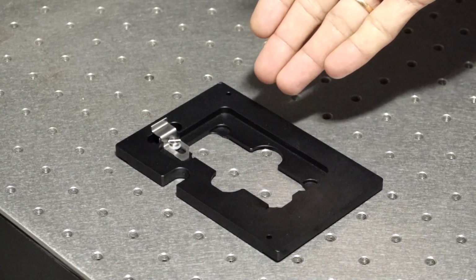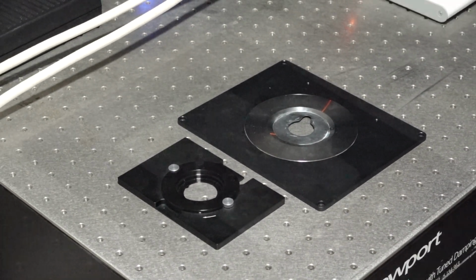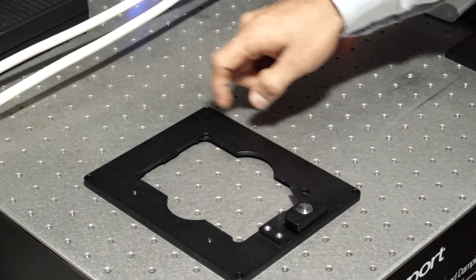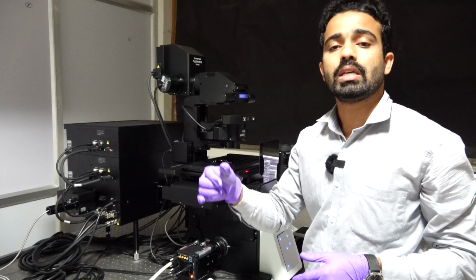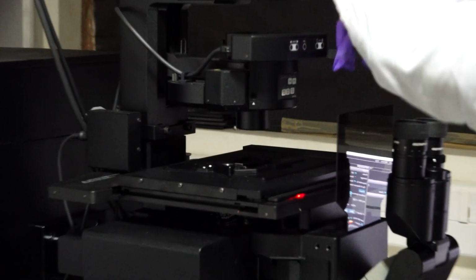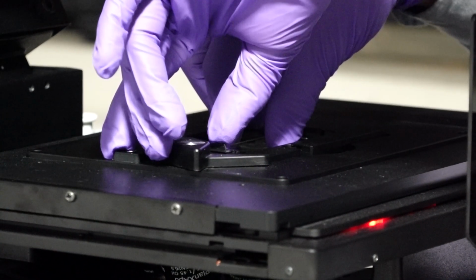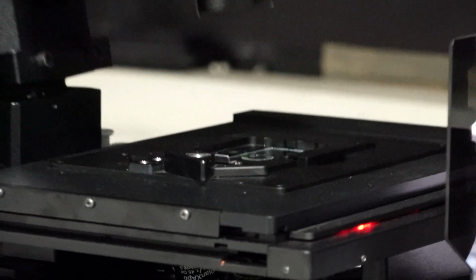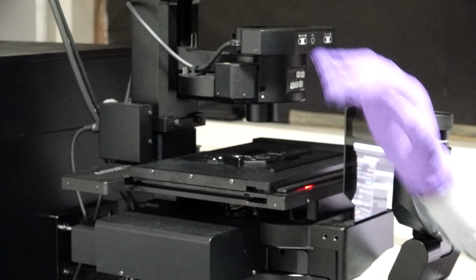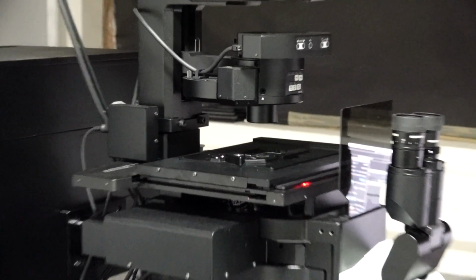So this is a holder to keep the slides. These are the 2 holders to keep the petri dishes, and we can directly keep the microtiter plates in this holder. This is one of the standard samples. We will place a sample in the slide holder. Once the sample is placed in the sample holder, we will focus the sample, then we will do the imaging with the software.